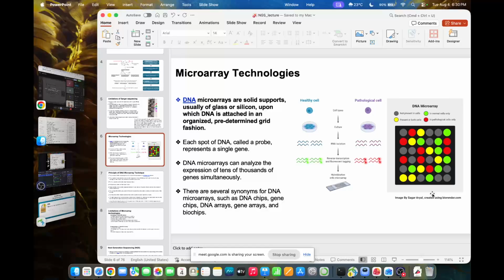Now, if you have a probe inside a microarray which will give you a signal proportional to the number of mRNAs for that particular gene, so if you have detected 5 mRNAs, you know that is a baseline expression. If you have detected 20 mRNAs, that means a gene is getting overexpressed, right? So that kind of analysis is also done using microarray technology.